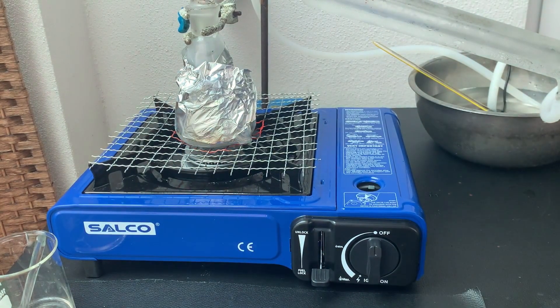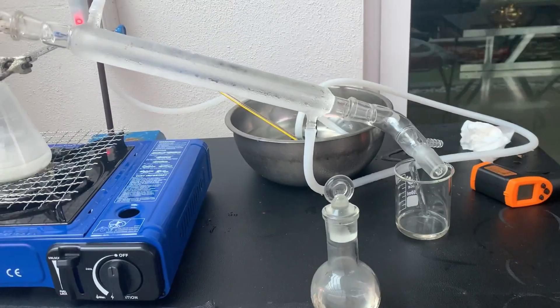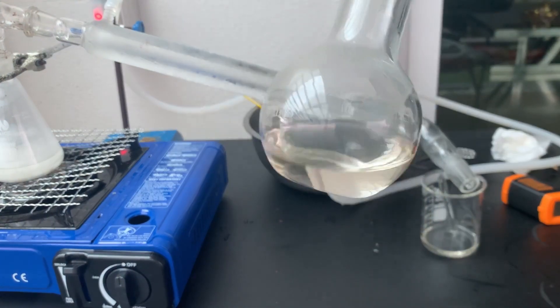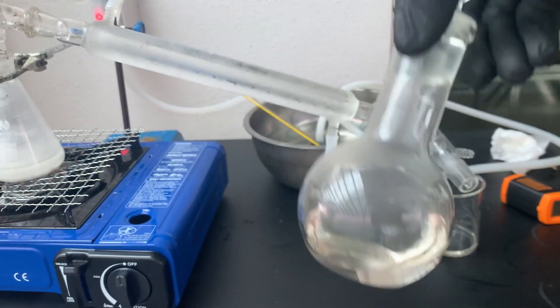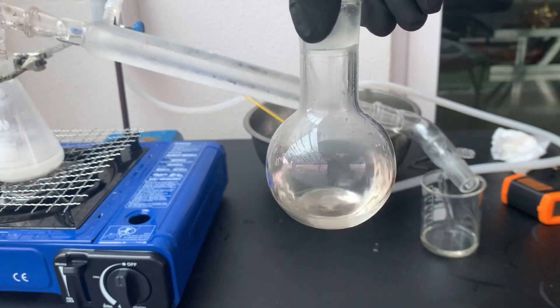I then let everything cool down to room temperature. And here's our final product — 30 mL of 70% oleum. This oleum will be used to make chlorosulfonic acid for the synthesis of sulfonylamide.